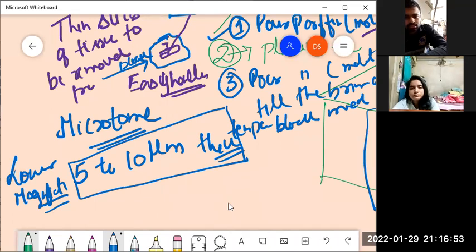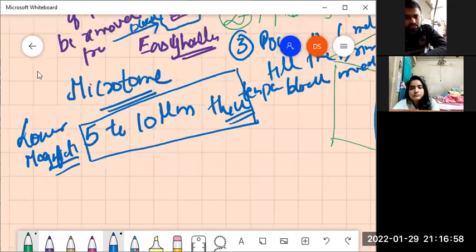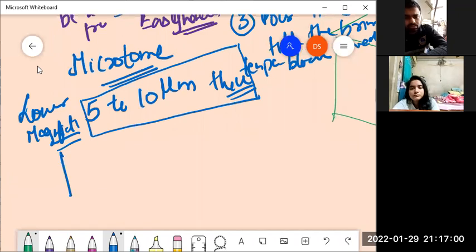Only after the observation of the gross details is over do we move on gradually to the higher magnifications to get the finer details. Understood? That is the process. We start, say, with 10x. Thereafter, we can move on to 20x for a bit more finer detail. Then we can move to 50x and finally to 100x. We can even move on to even higher magnifications.